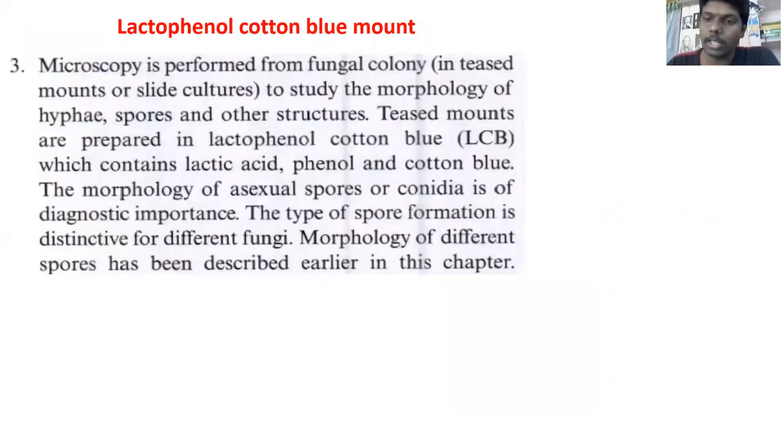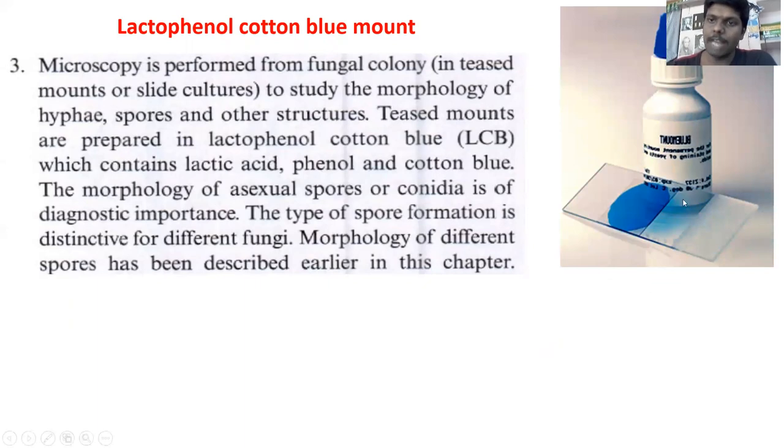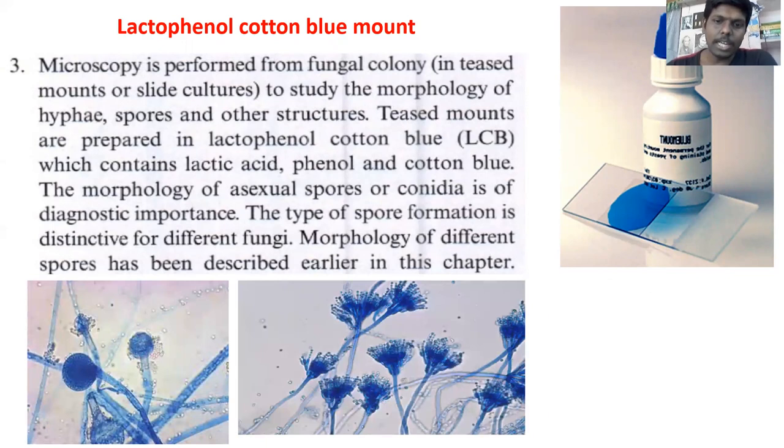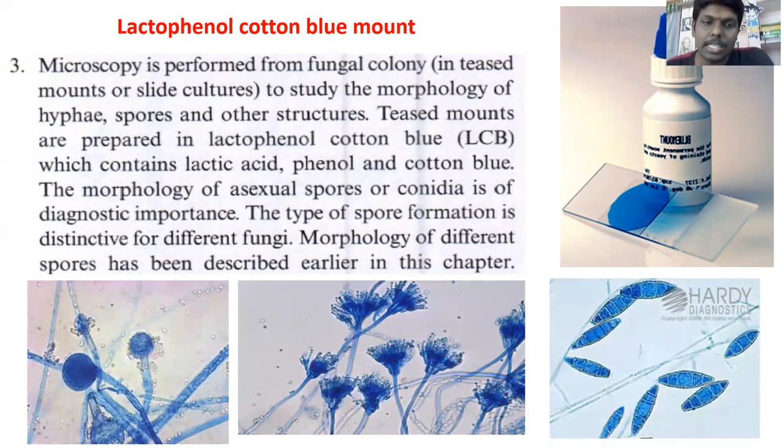Then let us see about lactophenol cotton blue. So in lactophenol cotton blue, what are we doing? We will take a glass slide and add lactophenol cotton blue solution, cover it with a cover slip, and observe under the microscope. Then you can see these beautiful pictures of fungus. So what is the advantage of LPCB? This LPCB won't destroy fungal morphology. We need not destroy the fungal morphology. We can see the true morphology of the fungus. That is the major advantage of LPCB.